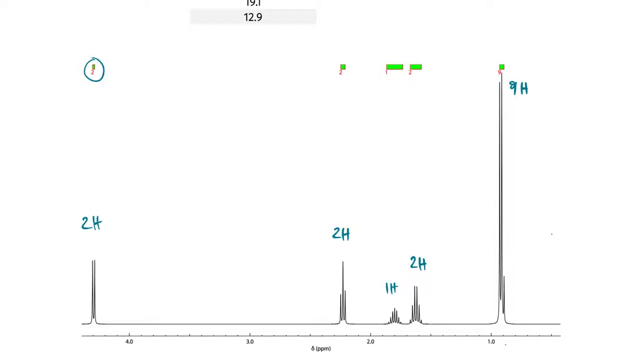Now, when you're doing this, I really encourage you to write down what you just observed in the spectra, because right now you would go back to your carbon and IR data and really take a closer look at the ester group. Okay, these will be your 2 oxygens in the molecule.